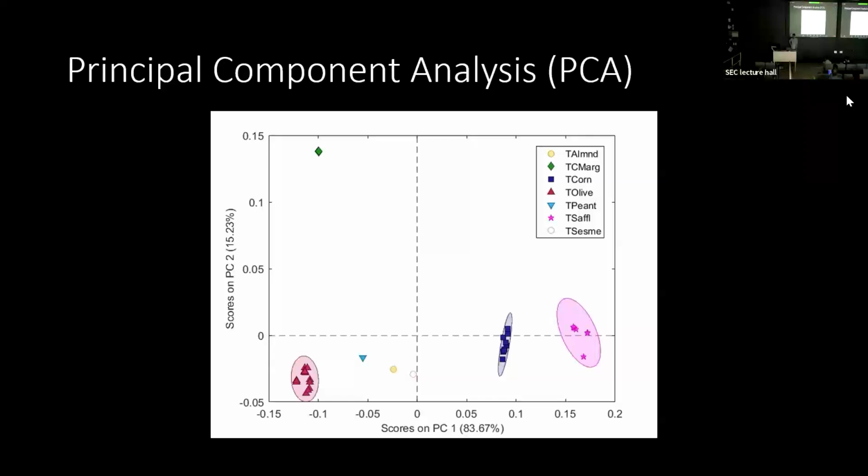Yeah, so with the concentration, we've seen improvements in the lab of like 2 or 3 orders of magnitude detection improvement for biomarkers. And Raman intensity versus concentration: the Raman intensity will change with concentration, and so you can back out concentrations.